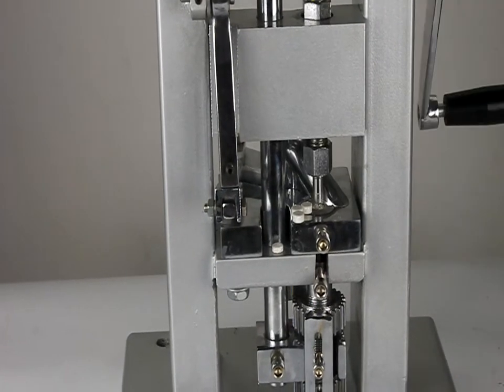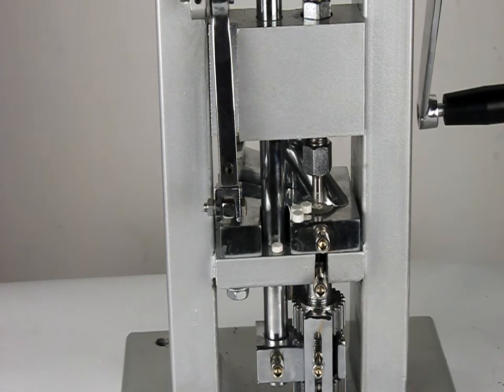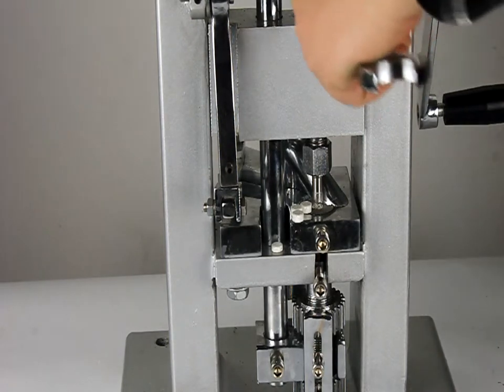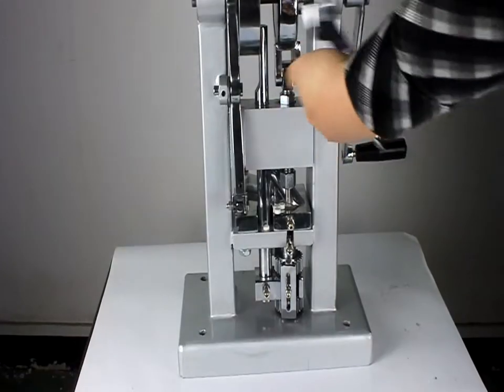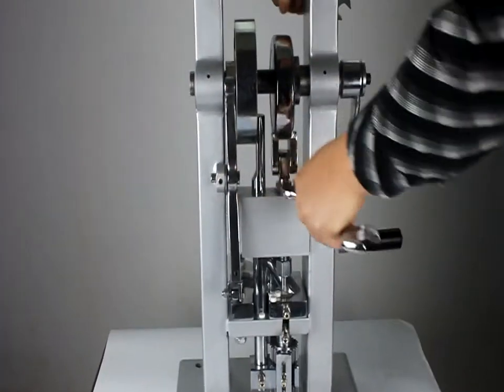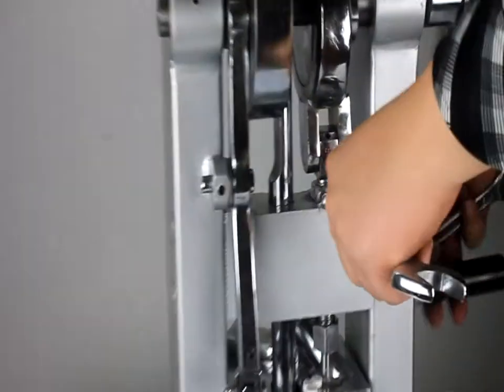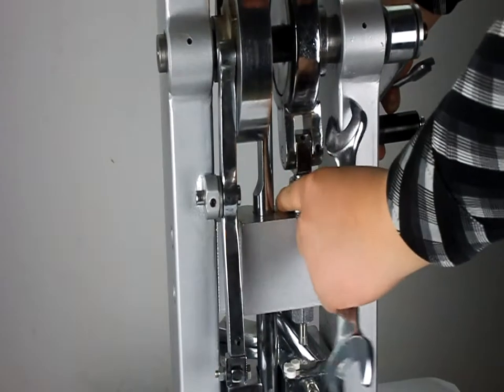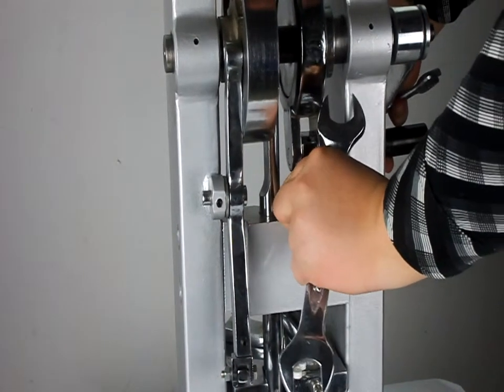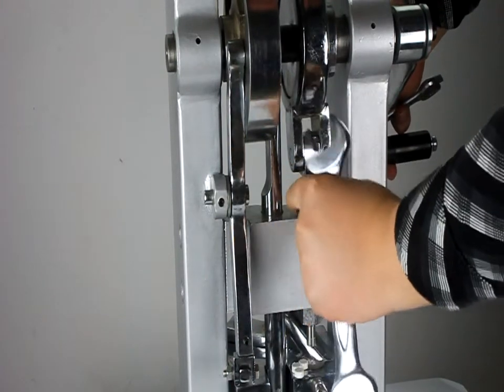Now we teach you how to adjust the hardness and the thickness of the tablets. As you can see on the top, this place is where you can adjust the hardness of the tablets.